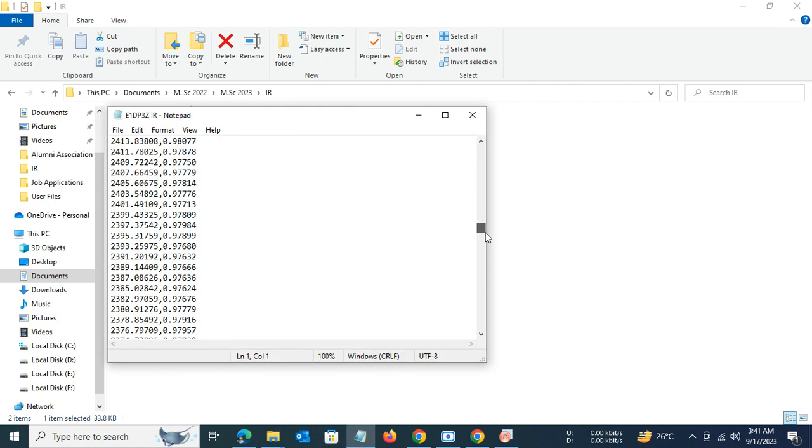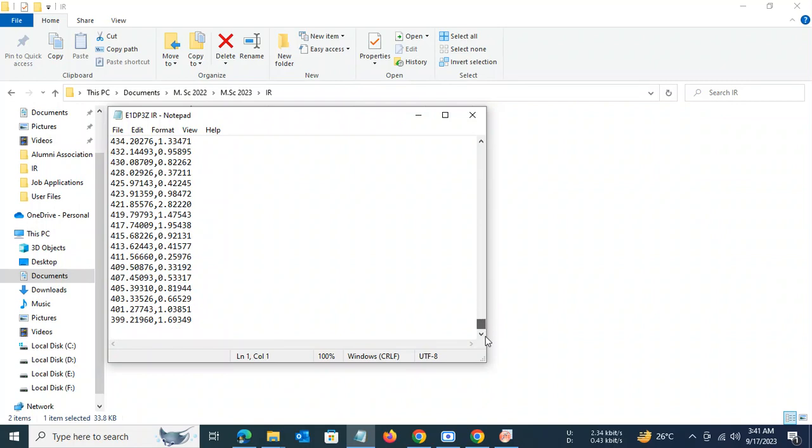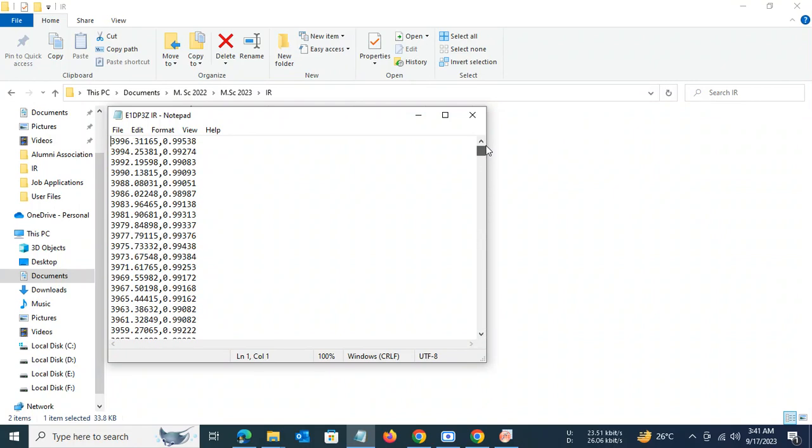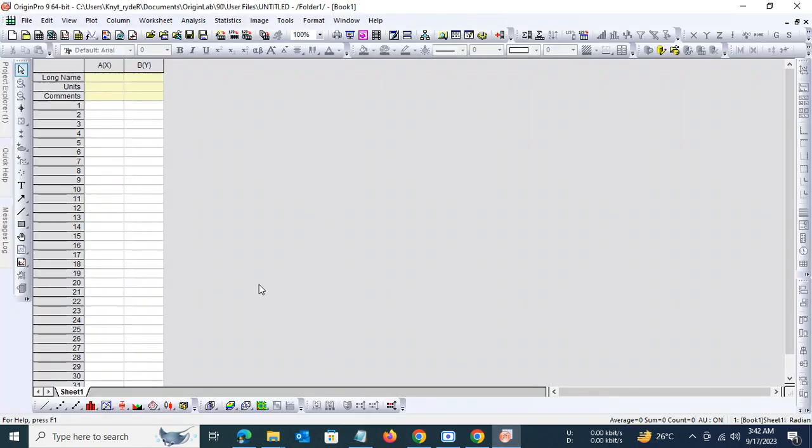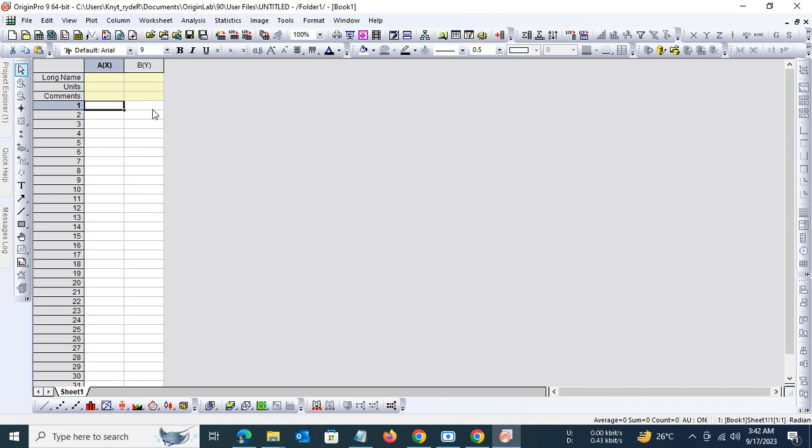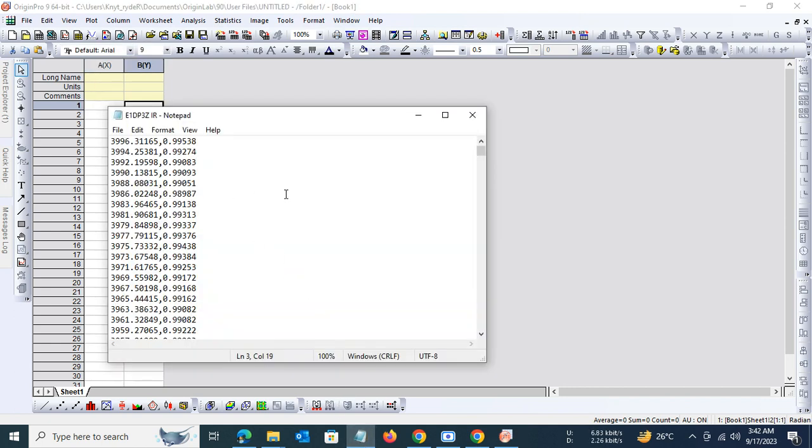Here is the IR spectral data before us. The problem is, as you can see, there are two columns of data separated by a comma marker. We do not want that because it will be a problem. We want the data to be separated into two individual columns.